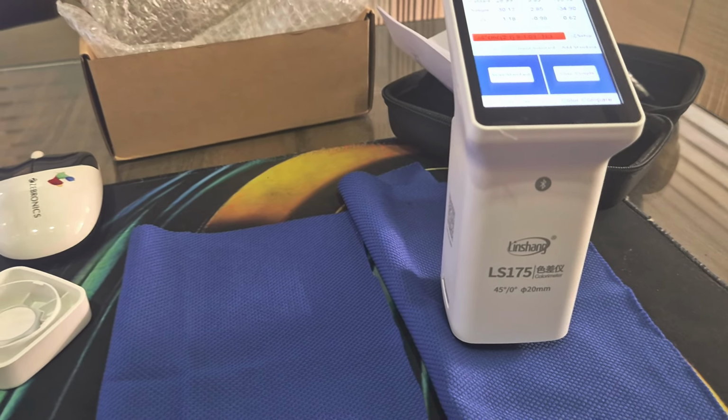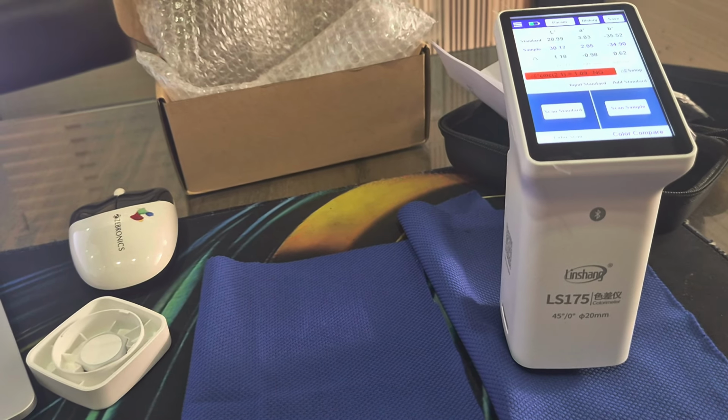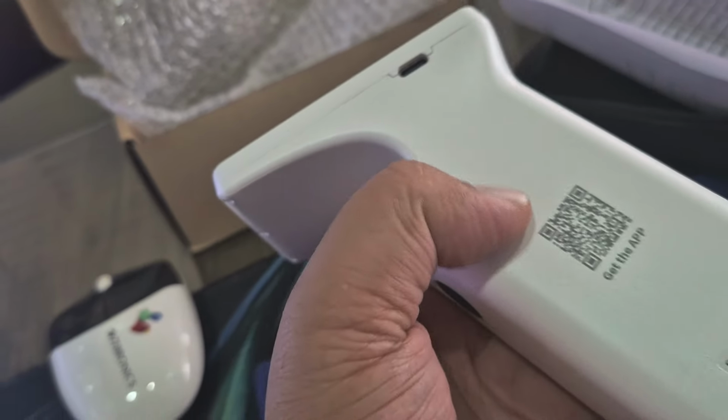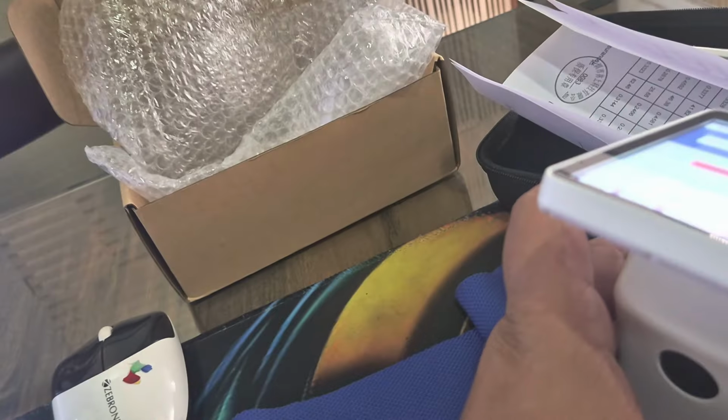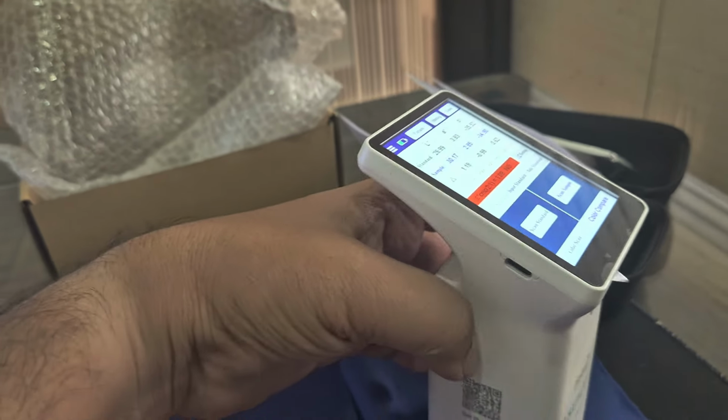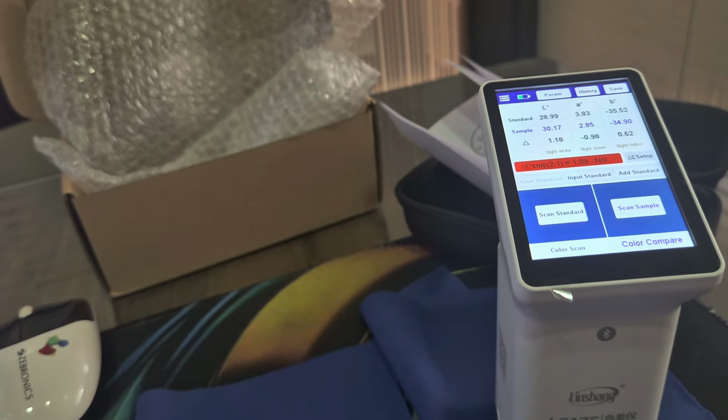This instrument can be connected with the mobile application, and the same screen will display on your mobile. That application you can download from this QR code. This application is available on the Google Play Store, and it is also available on the Apple App Store.